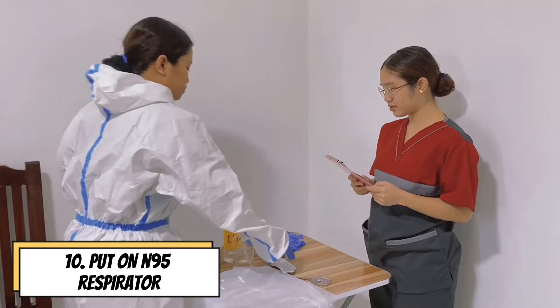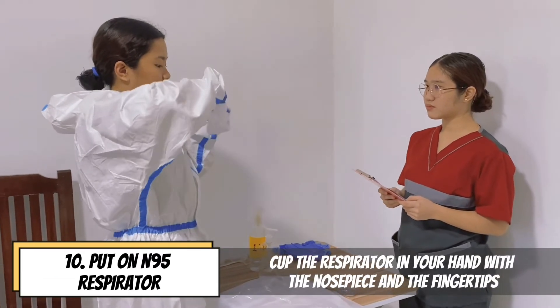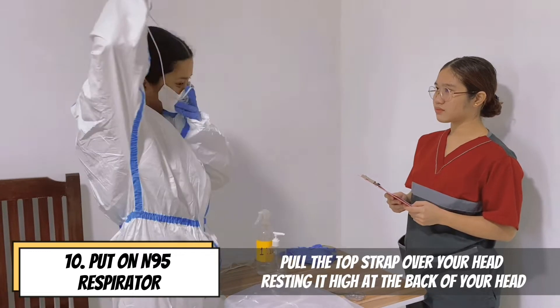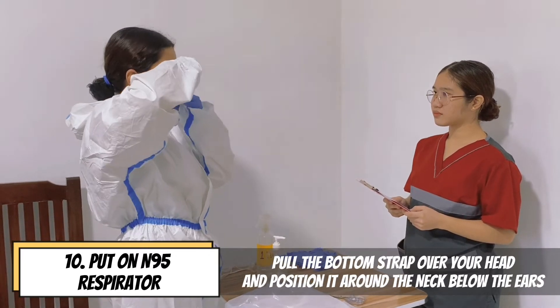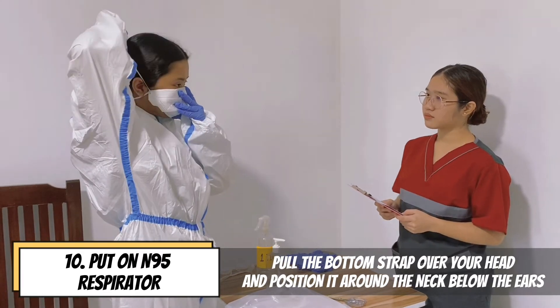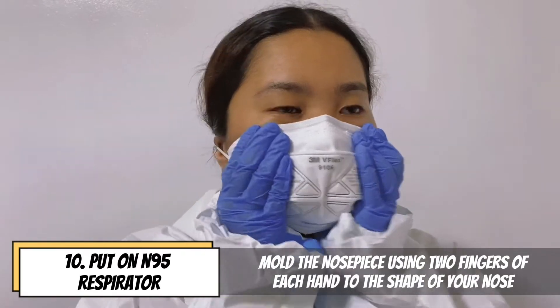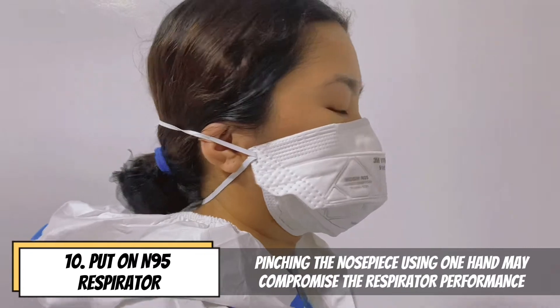Put on N95 respirator. Cup the respirator in your hand with the nose piece at your fingertips. Position the respirator under your chin with the nose piece up. Pull the top strap over your head resting it high at the back of your head and pull the bottom strap over your head and position it around the neck below the ears. Mould the nose piece to the shape of your nose. Pinching the nosepiece using one hand may compromise the respirator's performance.